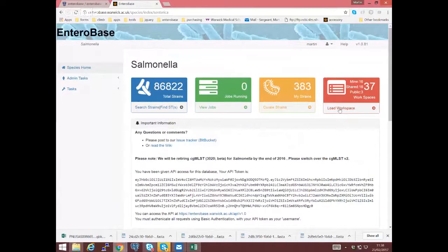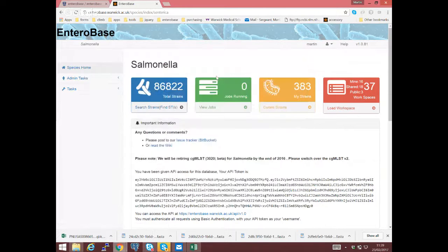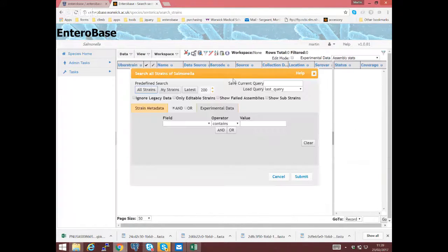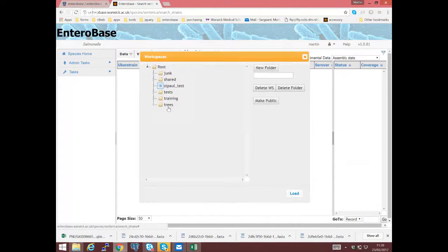Okay. It hasn't come up there yet, unfortunately. Okay, so for some reason the tree hasn't appeared.